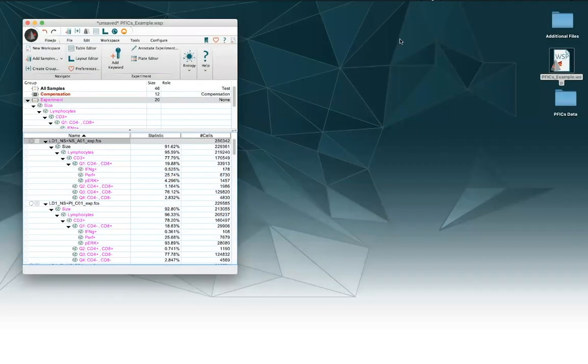Hello, I'm Dylan with the FlowJo product innovation team. Today I'm going to show how to change the stain name in FlowJo.